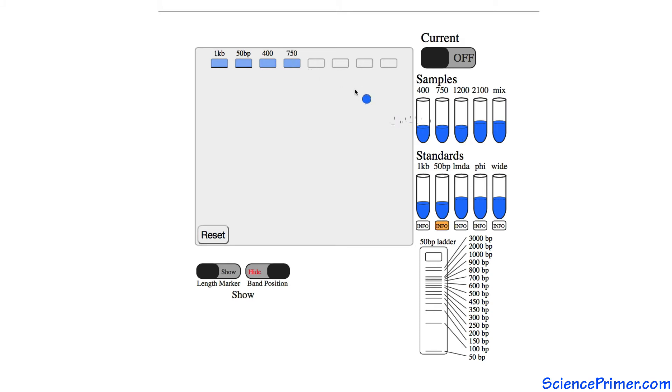The loading dye present in both the samples and the standards helps make sure each well loads properly and makes it easy to keep track of which wells already contain DNA. Once the wells are loaded, the power is turned on.